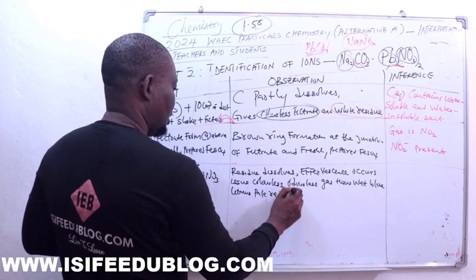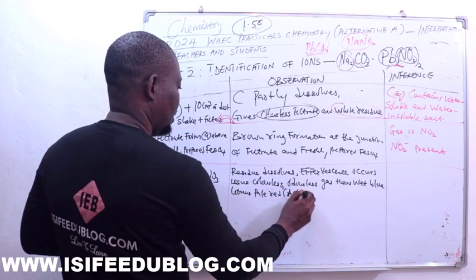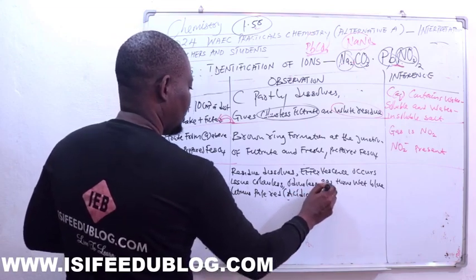So make sure the nature of the gas, it is acidic gas.